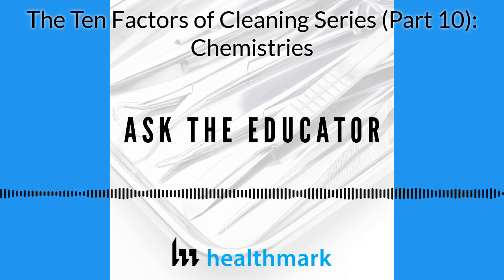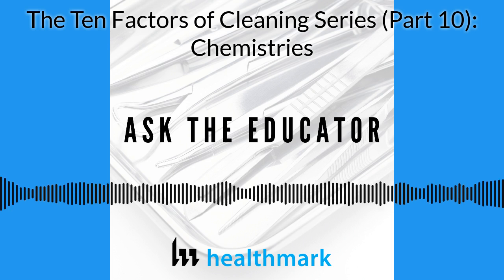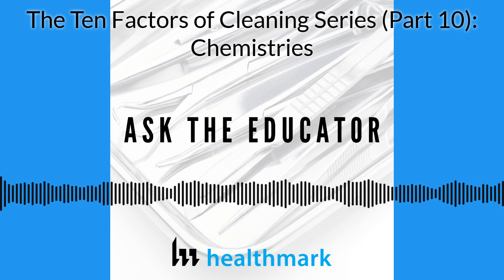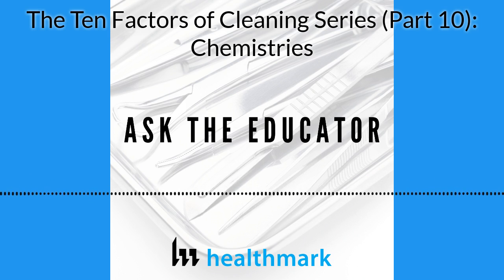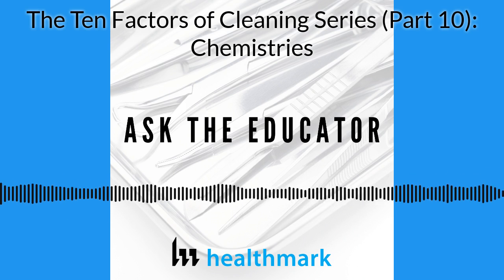There are terms and different things you have to know, but overall we want cleaning agents non-abrasive, low foaming, free rinsing, with rapid soil dispersion, non-toxic, of course, effective on all types of soil if you can make one that affects them all, and with a good long shelf life. Cost effective, of course, to keep supply chain happy and keep the budget down, and you can also monitor the effectiveness of their concentration and their useful life.